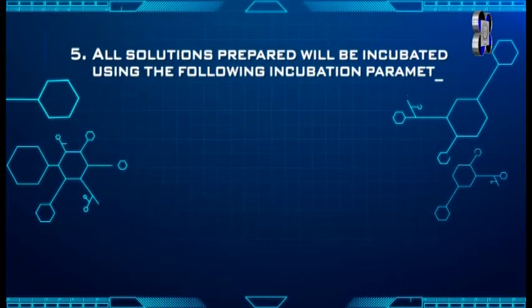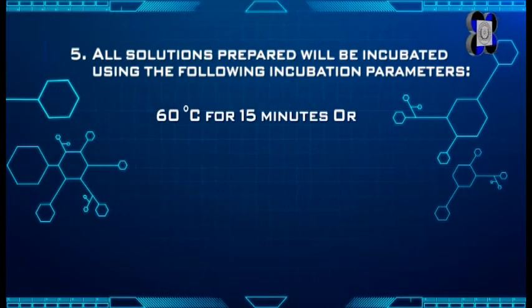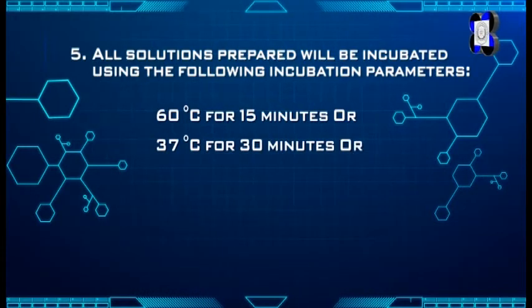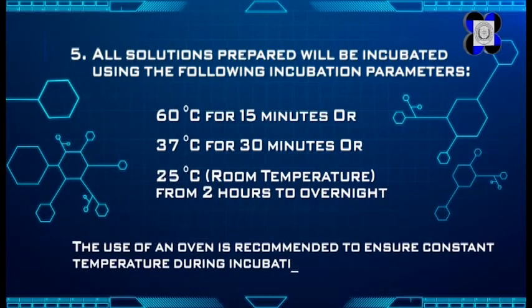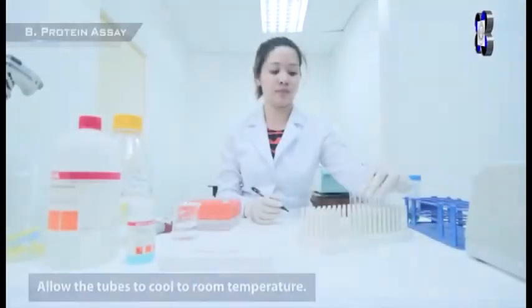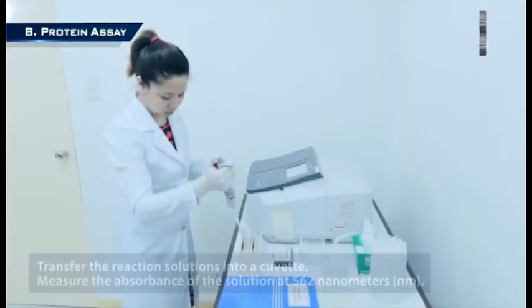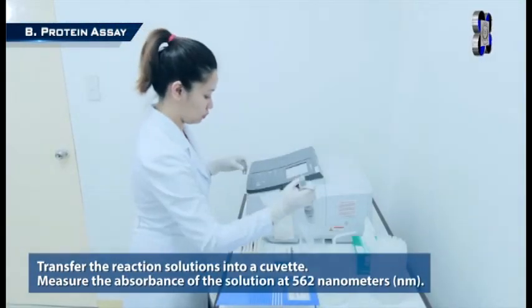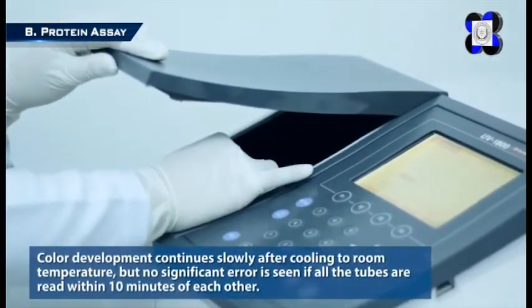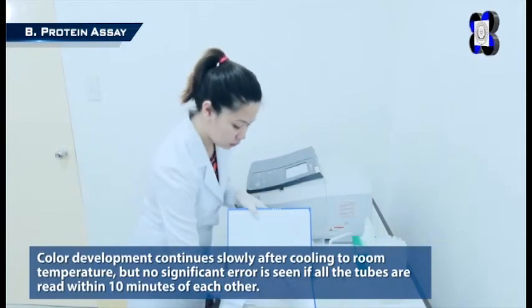Step 5: All solutions prepared will be incubated using the following incubation parameters. The use of an oven is recommended to ensure constant temperature during incubation. Allow the tubes to cool to room temperature. Transfer the reaction solutions into a cuvette and measure the absorbance of the solution at 562 nanometers. Color development continues slowly after cooling to room temperature, but no significant error is seen if all tubes are read within 10 minutes of each other.